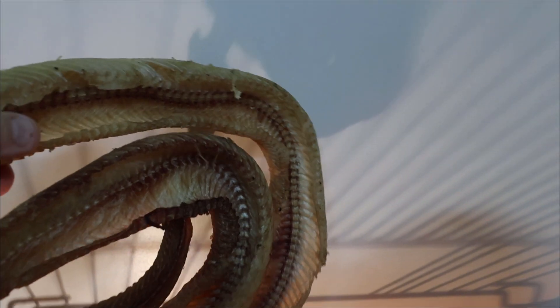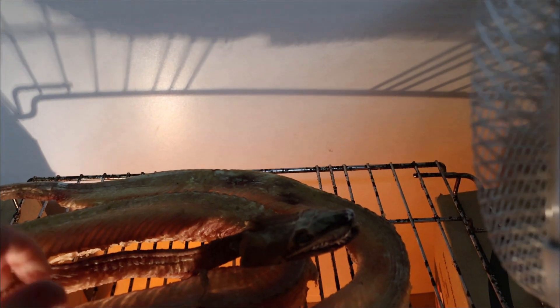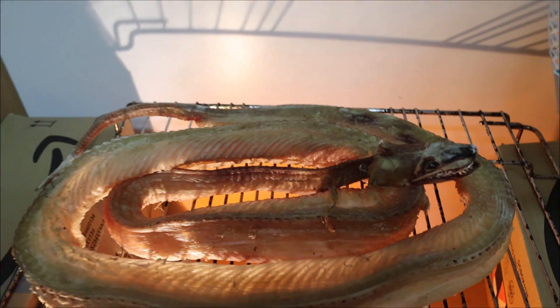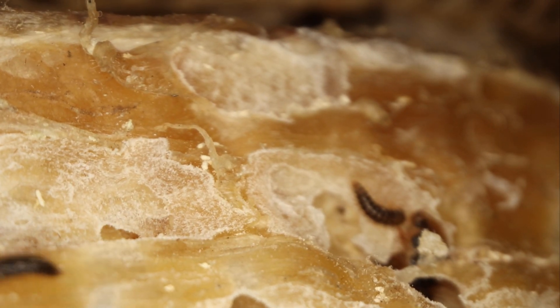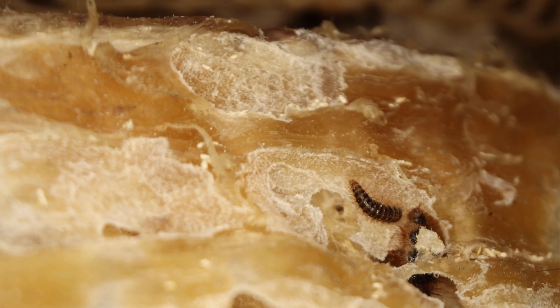At this stage there's little to no smell because the odour of rotting is caused by the decomposing bacteria which you've prevented through the drying process. The next and final step is to pop the dehydrated specimen in with the beetles and let them do their thing.